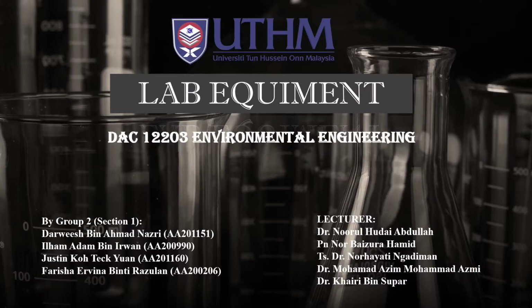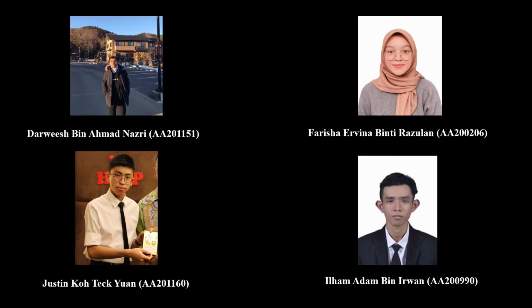The main topic of our video is lab equipment. Before that, I would like to introduce my team members. Me, Darwish bin Ahmad Nazri, AA201151, will explain about the total solid determination, TSD. Second, we have Justin Koktekiwan, AA201160, who will introduce biochemical oxygen demand, BOD, and chemical oxygen demand, COD.